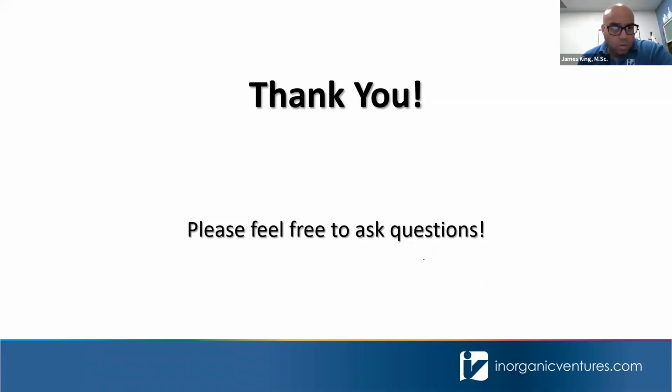So just continuing the conversation with cesium, we've got a question from Jake. When you decided to cut the step of adding cesium to each sample and standard, did you consider adding the ionization buffer in line using a T in the introduction system? That way the samples and standards receive the same amount of cesium and the tech is only prepping one ionization buffer or internal standard bottle.